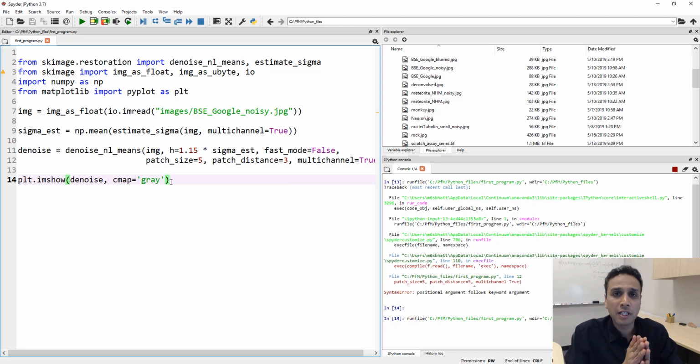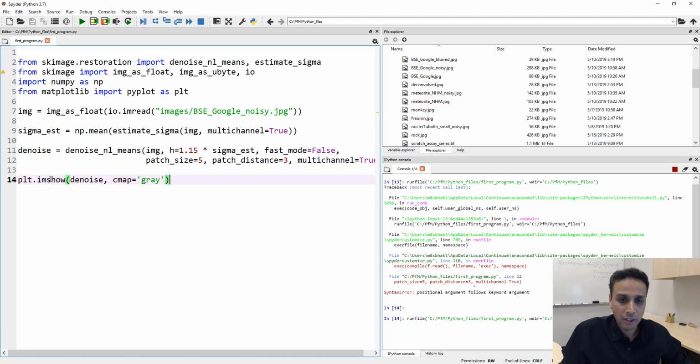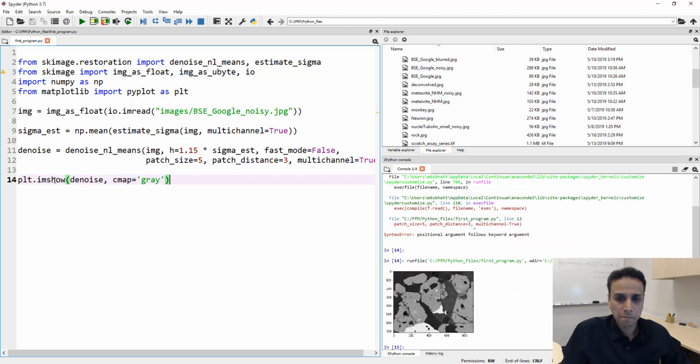And once we have the image, let's go ahead and look at the histogram and then pick the ranges for our histogram based segmentation. And plt.imshow. Okay.